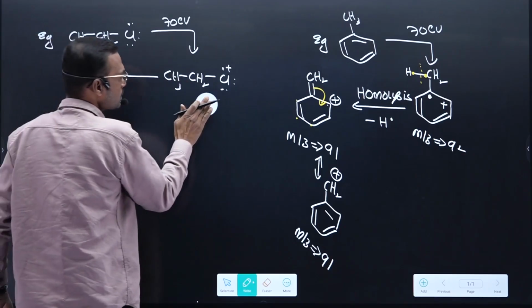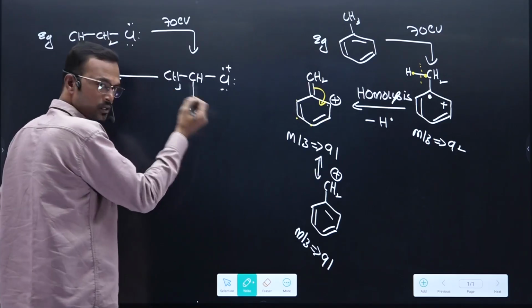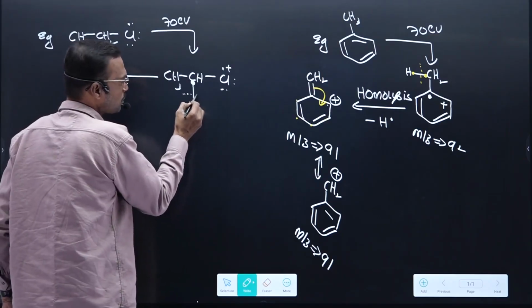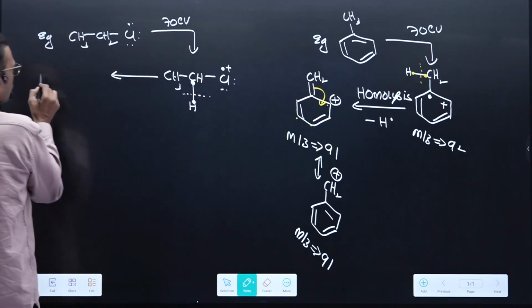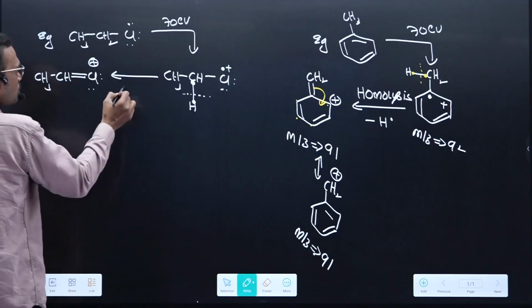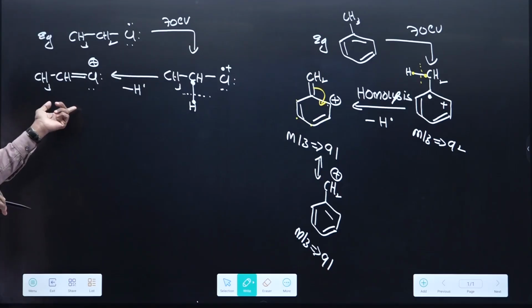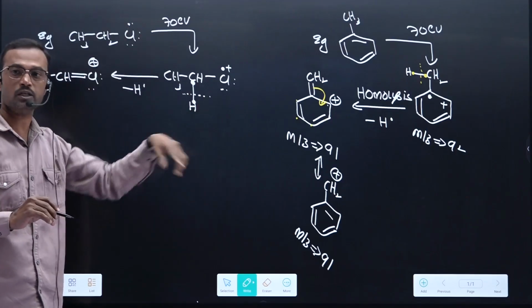See this. This carbon-hydrogen bond I want to break. You can break the carbon-carbon bond as well as the carbon-hydrogen bond. See, carbon has one electron, hydrogen also has one electron, break this bond. Homolytically, this radical forms. What do you expect? Double bond or not? Here CH, carbon-chlorine double bond, and here plus, here lone pair, hydrogen is removed in terms of H dot. So what is the kind of fission here? Homolytic fission. Okay, every time remember, after generation of molecular ion, fissions are applicable.